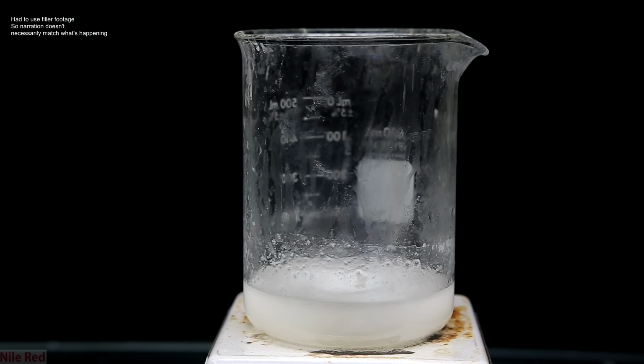Even at room temperature though, you can see that the reaction is still pretty exothermic. The reason for this is that we have a pretty concentrated solution of sodium hydroxide, and neutralizing it with hydrochloric acid produces a lot of heat. You might notice that where the hydrochloric acid is added and reacts, it produces an orangey yellow color.